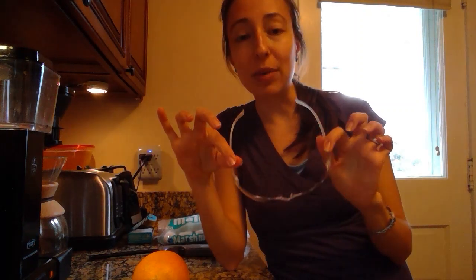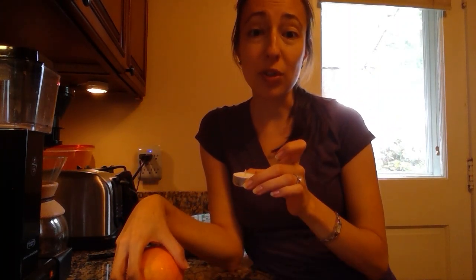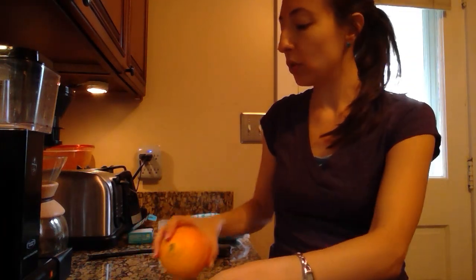You will also find some lovely glasses in your lab kit. So you want to make sure you're wearing these anytime you do an experiment. Even though we're just using an orange today, it could still get juice squirted up in your eyes. We do also have flames and some reaction will occur. So I do suggest using your glasses. If you wear glasses just for everyday seeing, and they're nice and big lenses, it's okay to use just those, especially if these don't fit very well over them. Okay, so make sure you have your clean counter space and you have everything set up and ready to go.